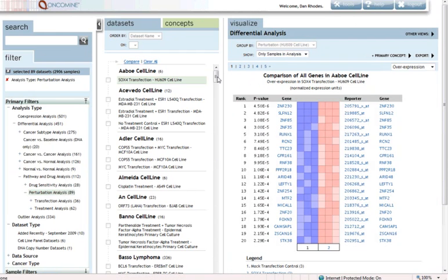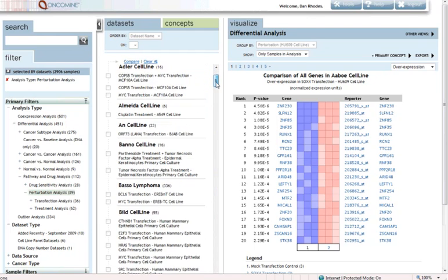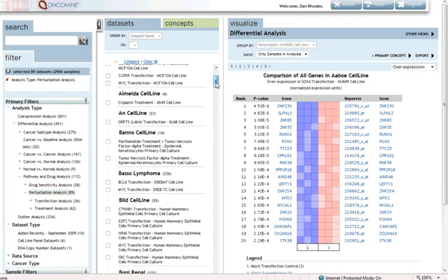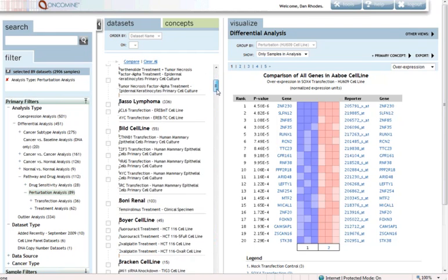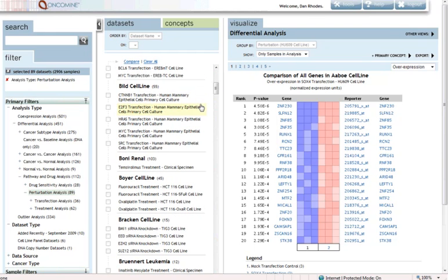Scrolling down this list, you see we've got a SOX4 transfection, we have estradiol treatments, we have MYC transfection, et cetera. You could browse this list, or you could search for the particular analyses of interest.